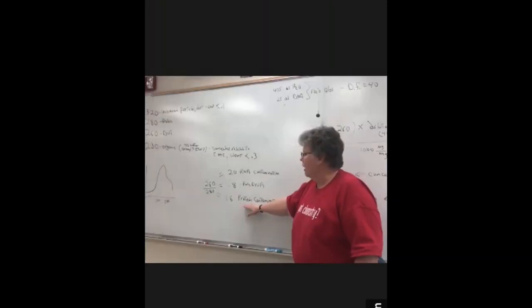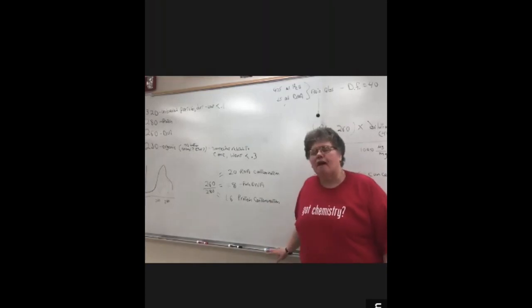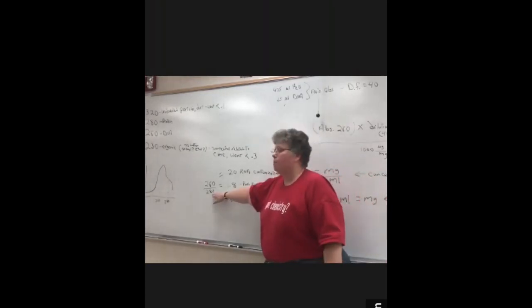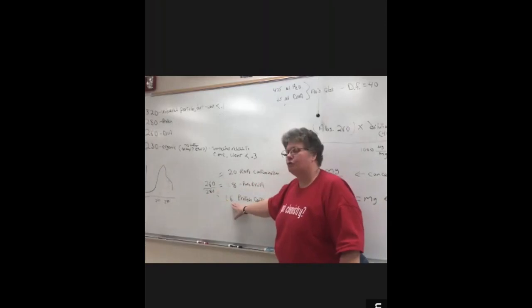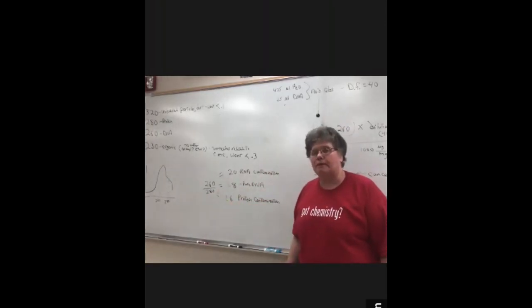If your ratio, 260 divided by 280, is around 1.6, this means you have protein contamination. So this is caused by, remember, protein absorbs at 280. So if you have a higher 280, that's going to decrease your ratio, and that's why it tells you you have protein contamination in there.